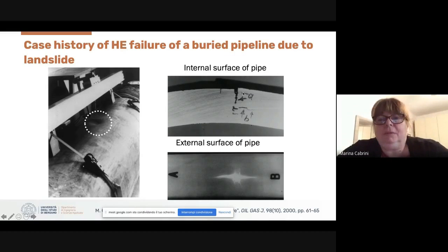In the metallographic section of the defect, there were hydrogen embrittlement cracks and some stepwise cracking, because the steel was a ferritic-pearlitic banded steel, an old pipeline steel with manganese sulfide inclusions that make this stepwise cracking start. And this is the hydrogen embrittlement crack in the most tensioned zone on the inner side of the pipe. This is the radiography of the defect.